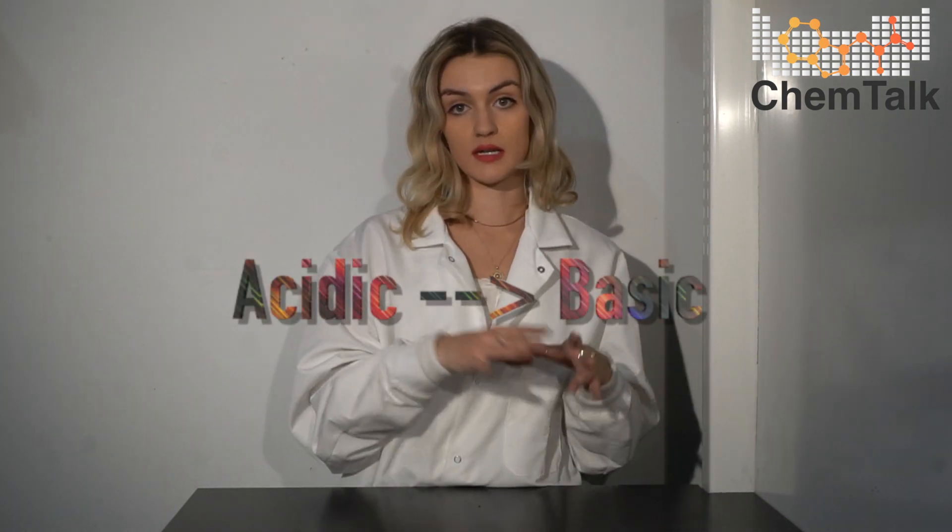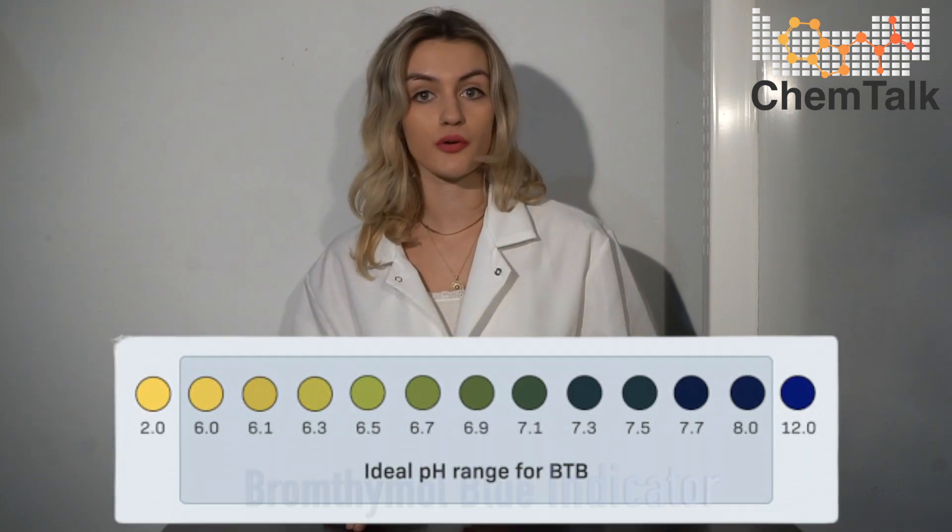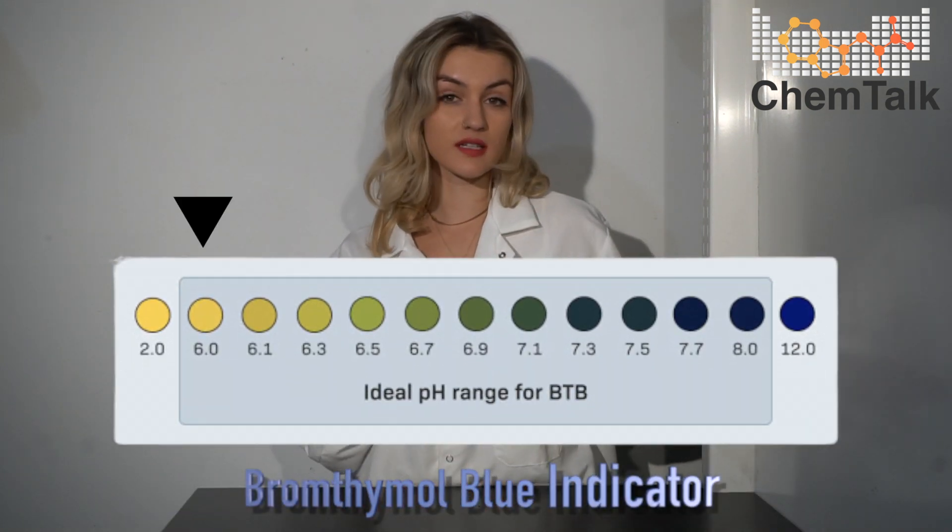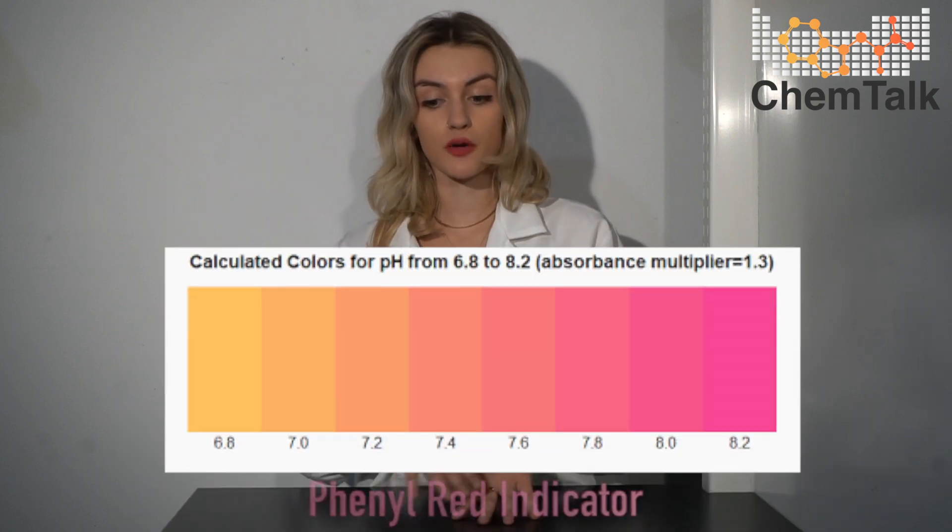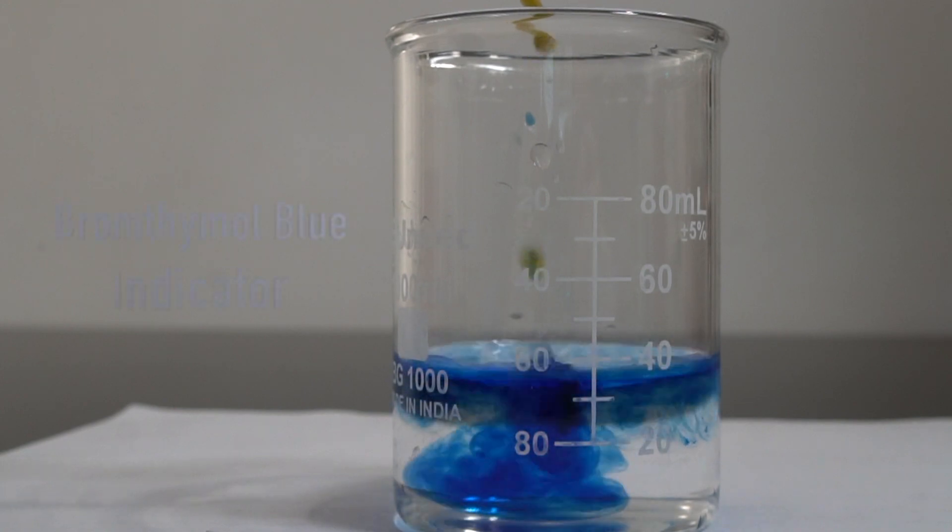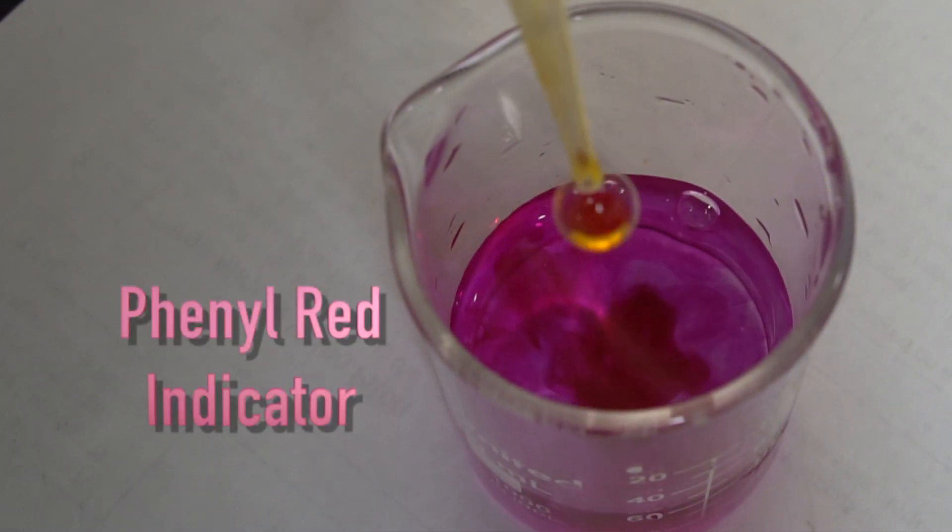pH indicators are the most effective in their intermediate range. This is the range of pH where it's changing from acidic to basic. For bromothymol blue, the indicator range is from about 6 to 7.5. And for phenol red, it's about 7 to 8. So if our soil is slightly acidic, we should be able to catch it with the bromothymol blue. And if it's slightly alkaline, we should be able to catch it with the phenol red.